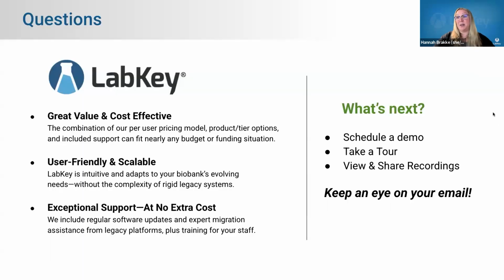And so together, these tools really offer that full transparency and traceability, which align with those ISBER best practices and help prepare your repository for confident compliance within the system.